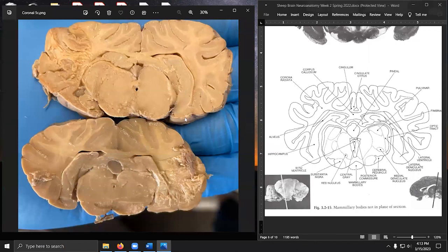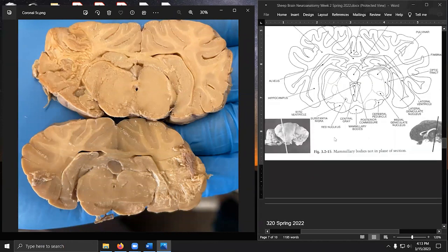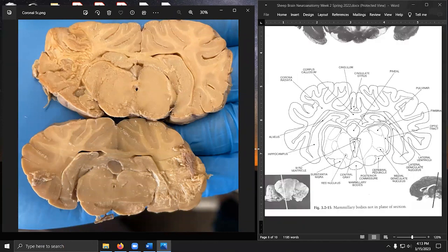So again, we have another example. The top is actually the section that we were just looking at. The bottom is where the cut is less lopsided. So the two sides are a little bit more equal. And so we have something that may resemble the picture a little bit better in this case. So we can do this one more time.